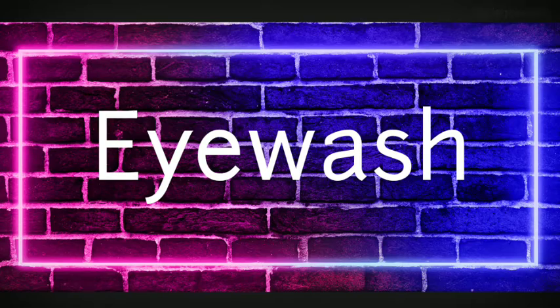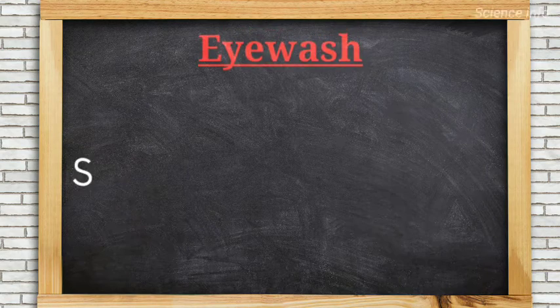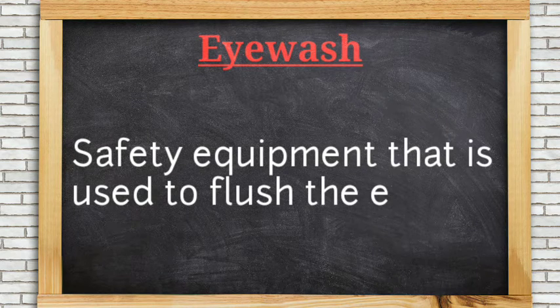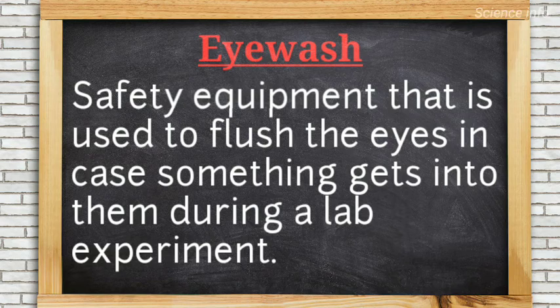Eye wash. Safety equipment that is used to flush the eyes in case something gets into them during a lab experiment.